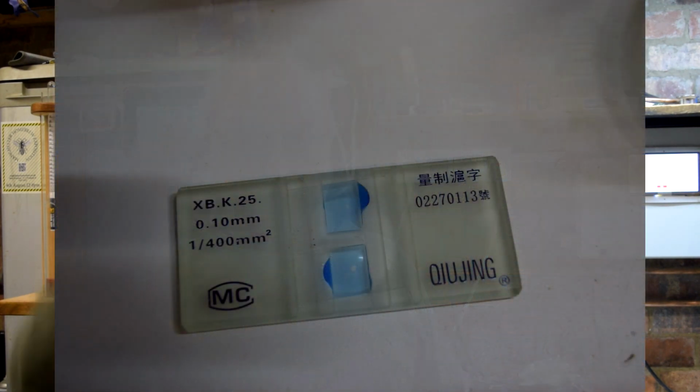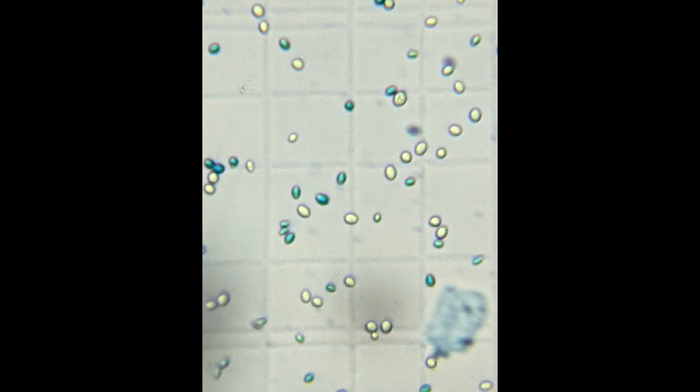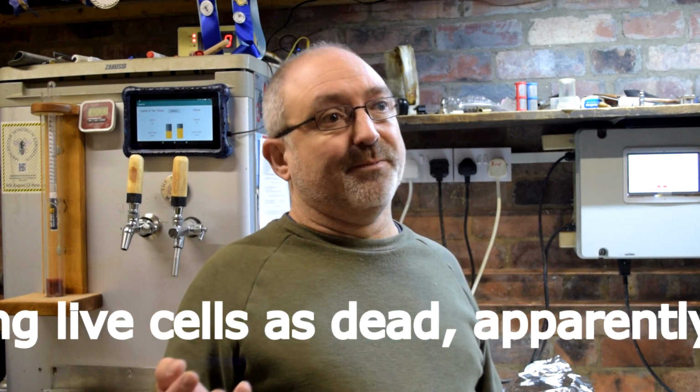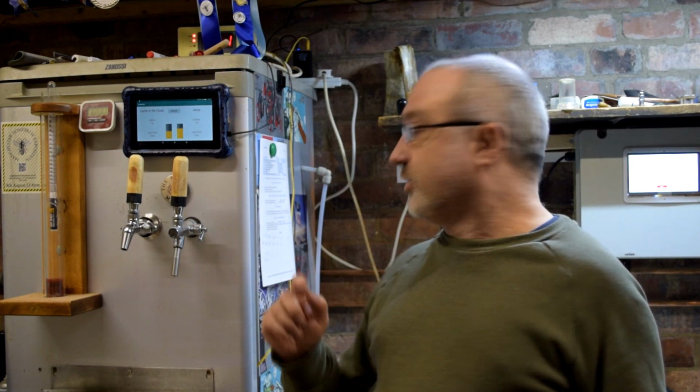Okay, now we've had a look at the hemocytometer with some cells on it. This is where I started to count, and obviously I'm going to do that optically rather than through a photo, so back in a second. I'm not entirely sure that dyeing the cells worked properly. Maybe I didn't leave it long enough or something, as I seem to have about 50% blue cells and 50% non-blue cells, which seems a bit wrong. Either I've got very non-viable yeast or something's gone wrong here. So I ended up with 115 non-blue cells and 116 blue cells in the 5 squares I've counted.